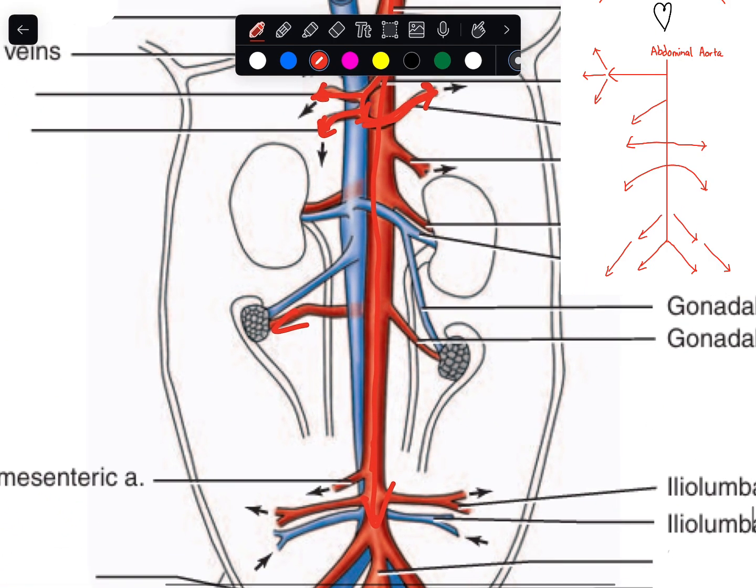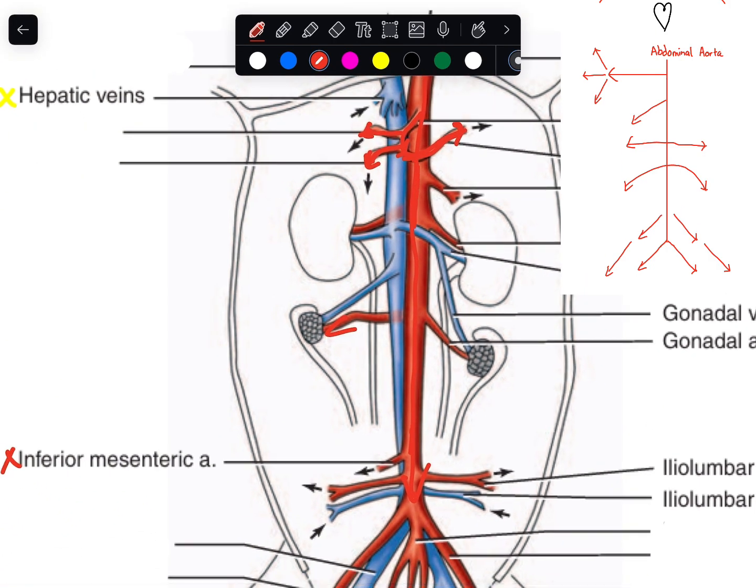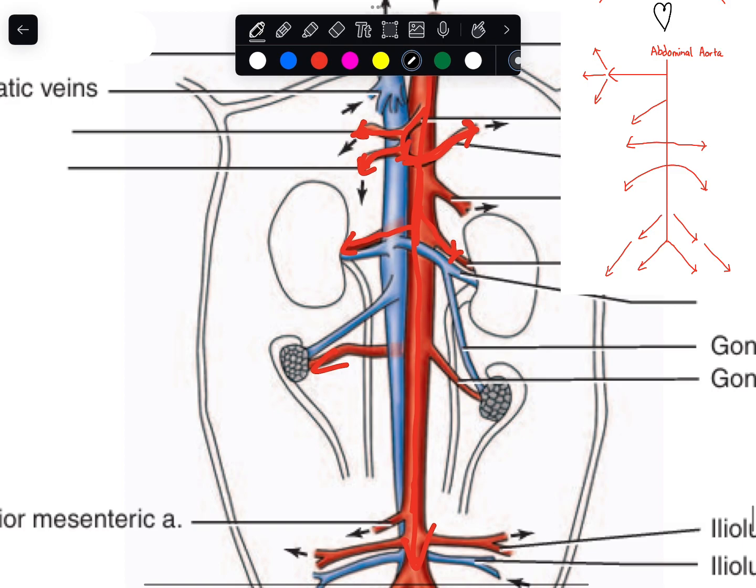Cool. Now going downwards even more, this right here is called the renal artery. They connect into the kidney. They supply blood to the kidney, or they deliver whatever stuff to the kidney. And then going transverse like this, that's the spermatic/ovarian artery for cats.